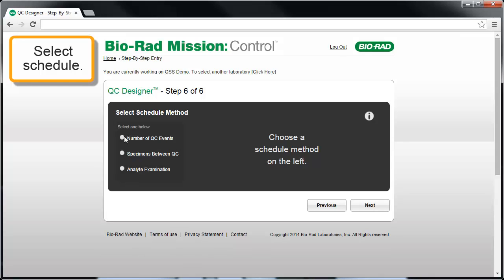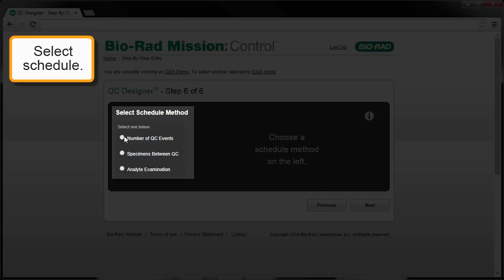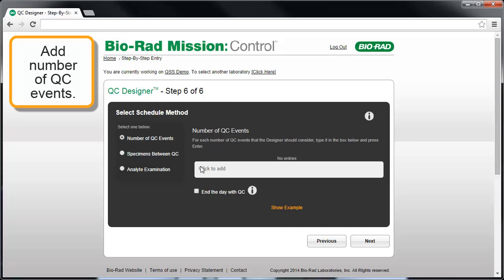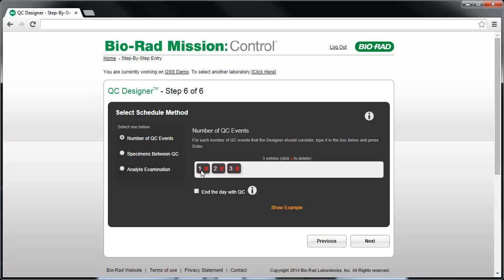In Step 6 of 6, select how you want to schedule QC events and the different possible frequencies of QC testing you're willing to consider. The choices include number of QC events per day, number of patient specimens examined between QC events, or analyte examinations — which is the number of patients tested for a given analyte between QC events. In this case, we'll pick number of QC events per day and indicate we're willing to consider 1, 2, or 3 QC events per day.